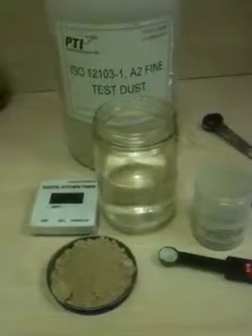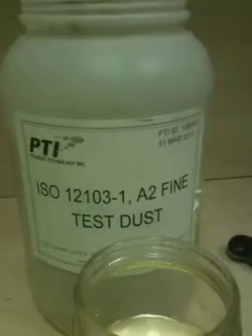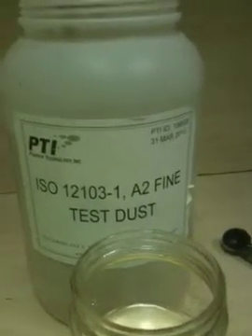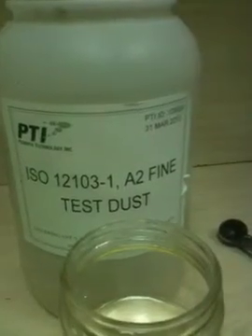This is a short video showing the flocculating powers of Floccin 1-1-0-5. We have 200 milliliters of water and 10 teaspoons of test powder, which is ISO 12103-1 A2 fine test dust. We are going to use one quarter teaspoon of Floccin 1-1-0-5.